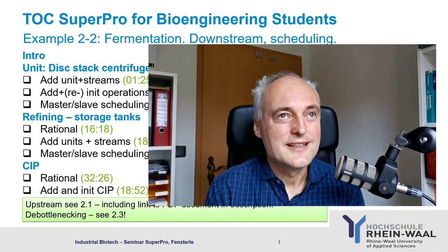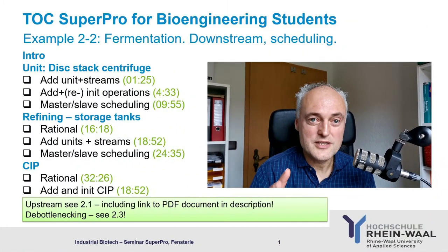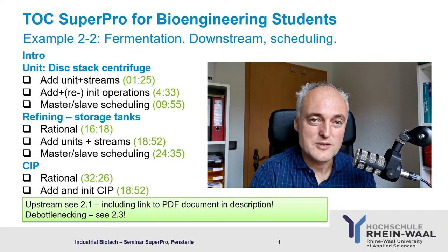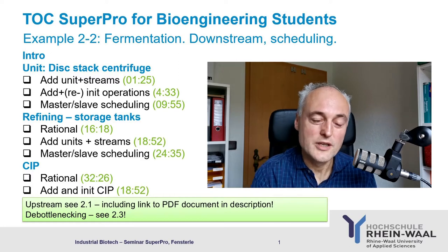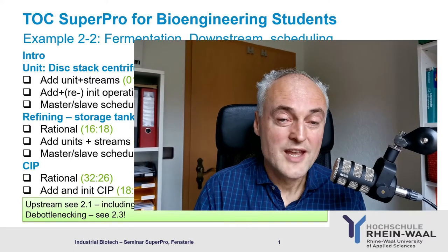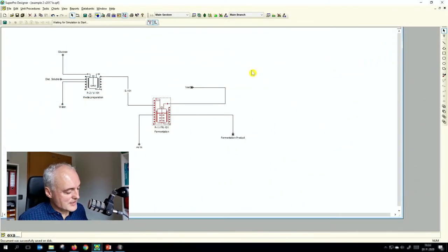We have done the basic setup with a bioreactor, a fermenter, and upstream a media preparation. We learned that with more than one unit we need to think about scheduling. Now we add downstream units: a centrifuge and some blending tanks, and you will see that the major task is scheduling.